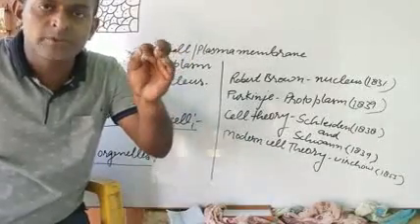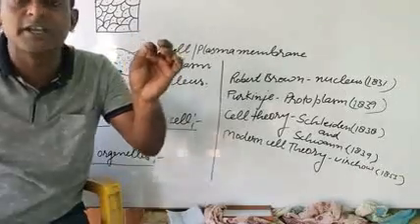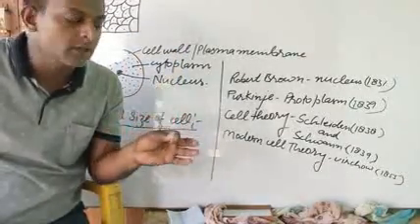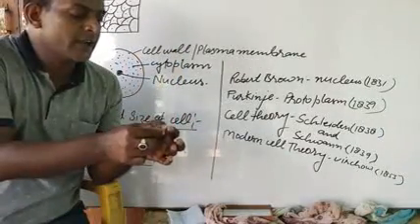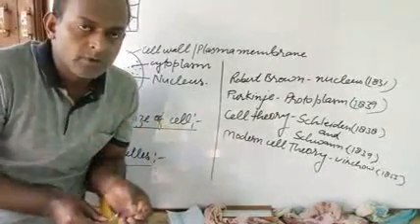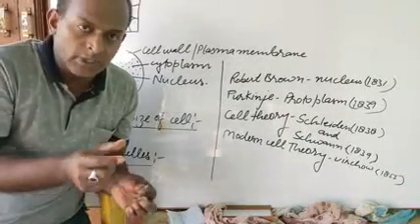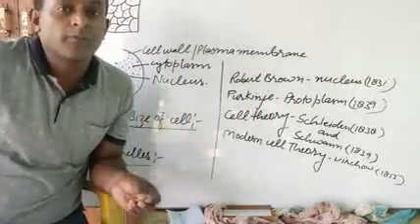In your lab this solution will be available. With the help of this solution you will stain it properly. After that your slide is ready to mount in the microscope. For this there is a need of a microscope. So at this time there is no availability of a microscope.